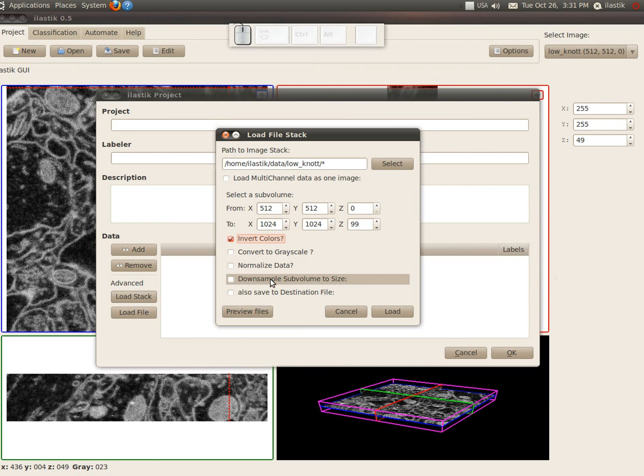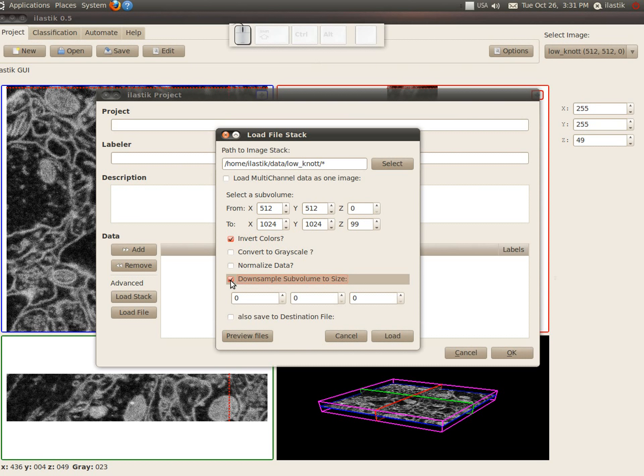If you want to downsample the subvolume to a certain size, because, for example, it doesn't fit into the memory of your machine, you can do it with this option. So you don't really have to do it here.